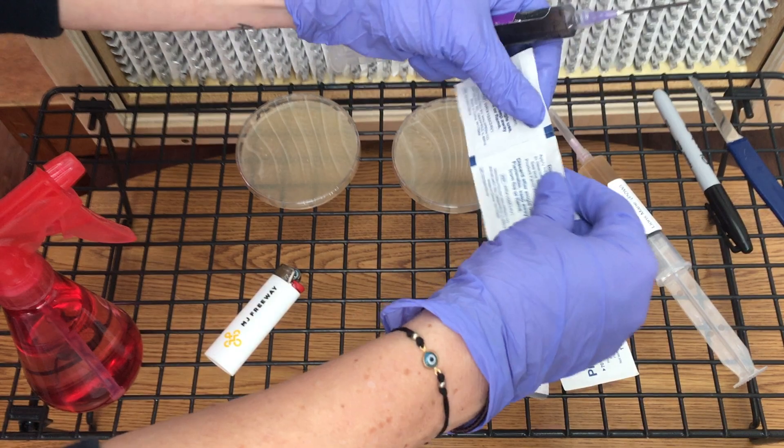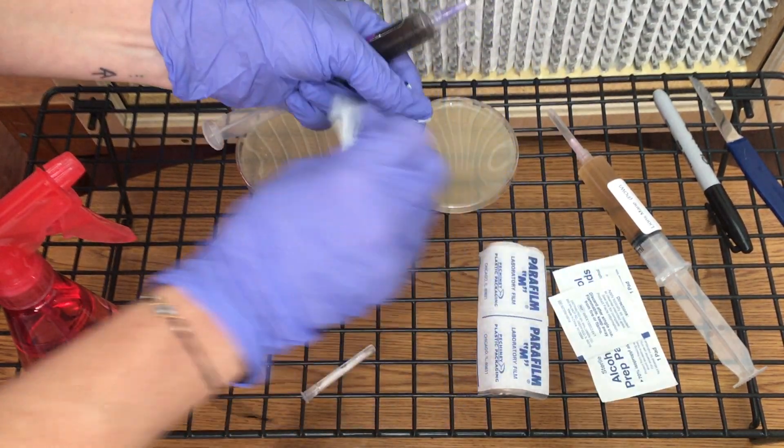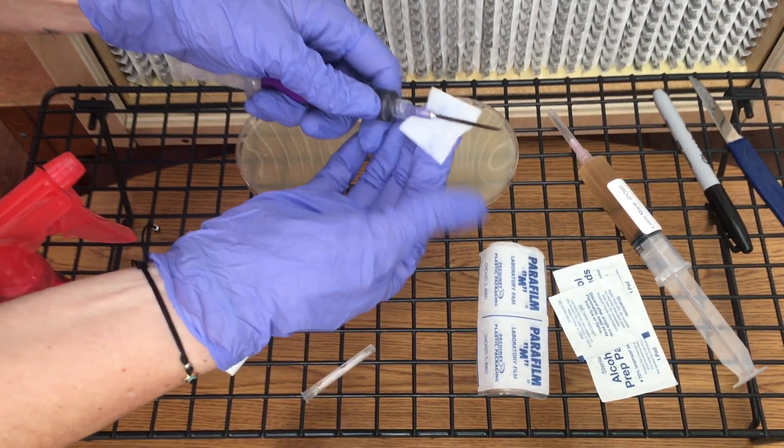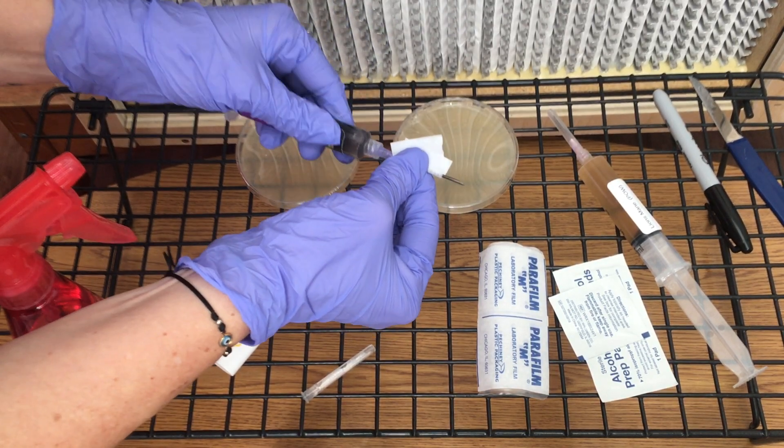Then after 30 seconds, wipe the needle with an alcohol pad to remove all the soot. You should see rust when you apply the pad to the needle.